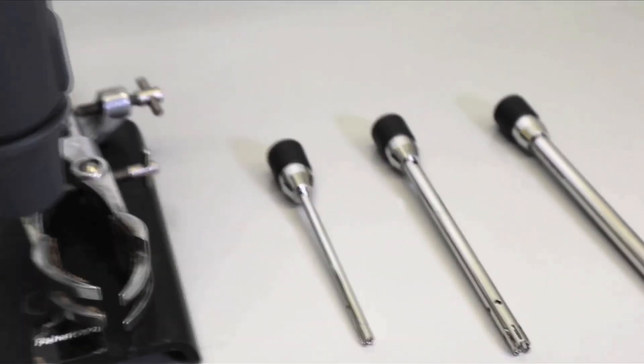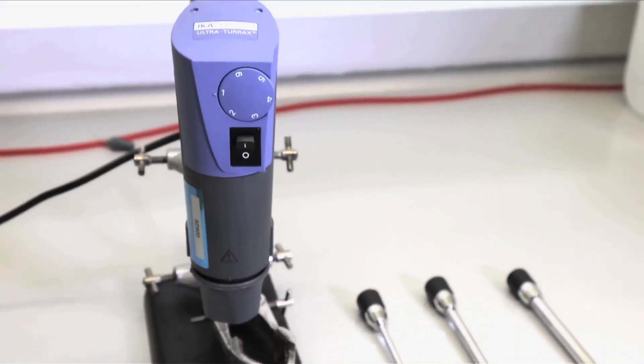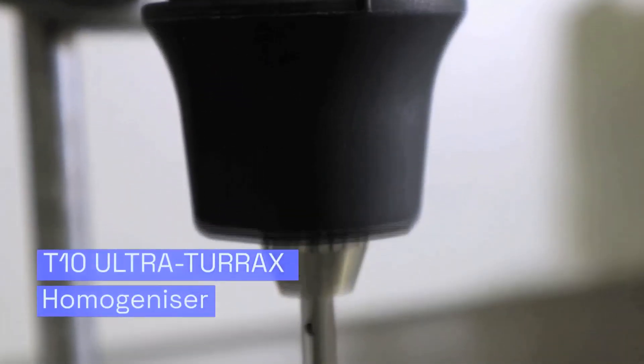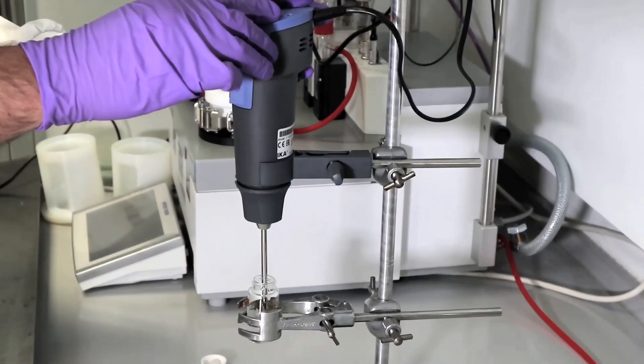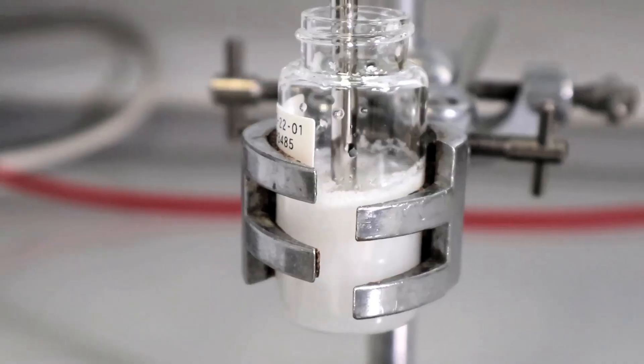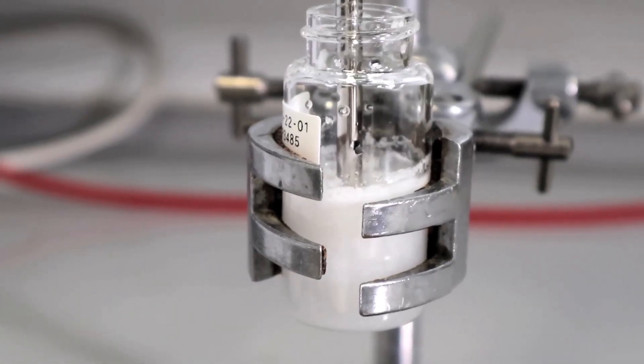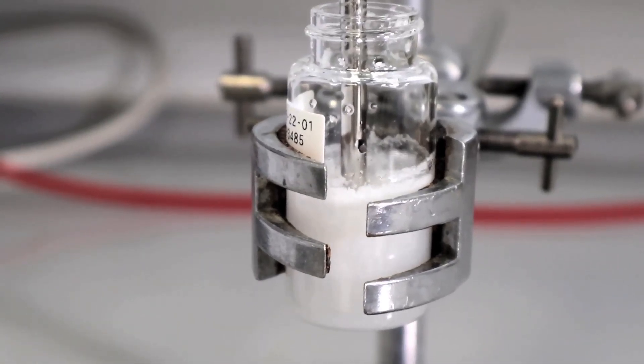We can carry out solvent system assessments at small scale using our ultra-turax dispersion unit, the T10 from Iker. This assessment of wet milling feasibility at an early stage allows us to guide the particle engineering of your product to the correct technology in an efficient streamlined manner.